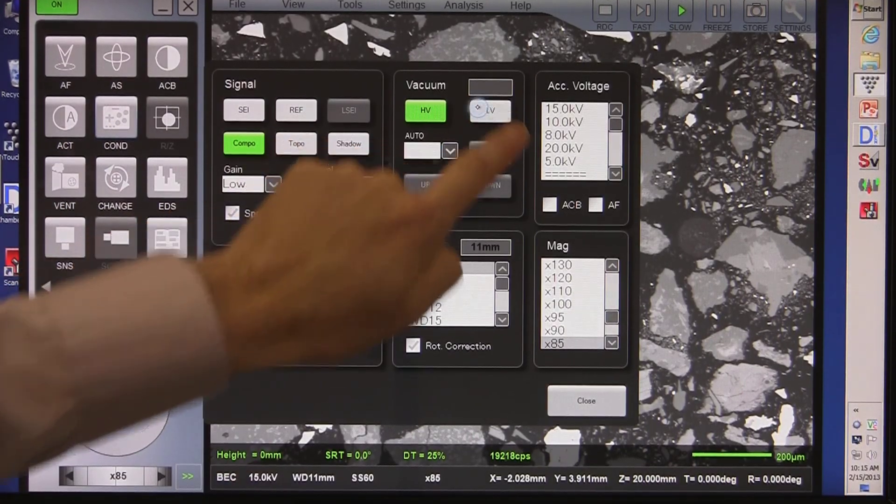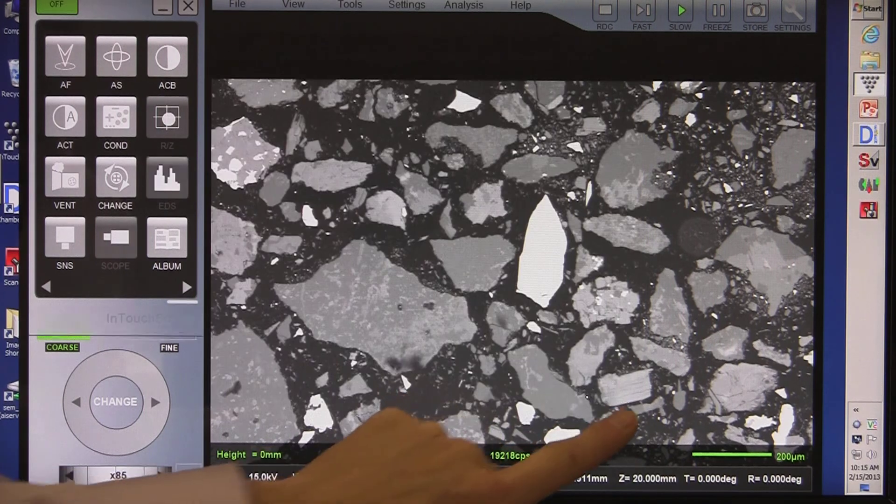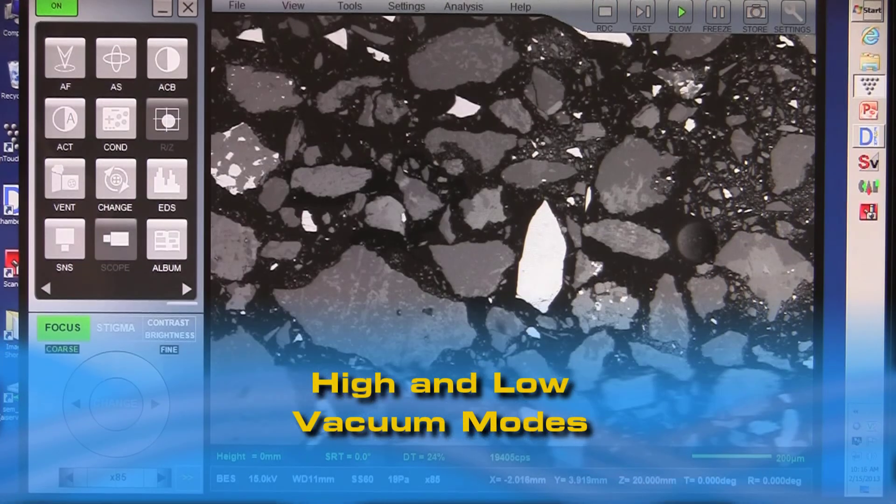Switching from high vacuum to low vacuum is done at the simple touch of a button, without the need for venting or hardware exchange.